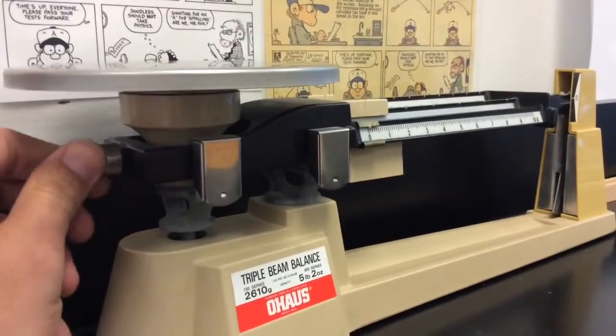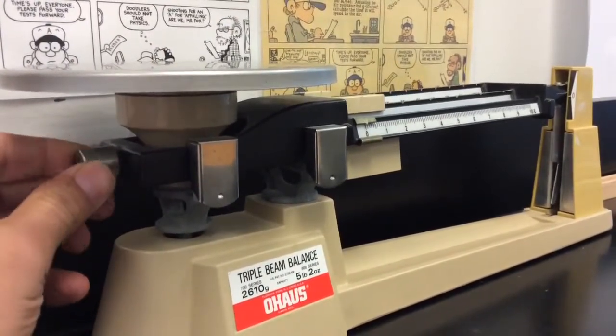Here's a close-up view of that. You can unscrew a little bit or screw it in a little bit to balance it out.